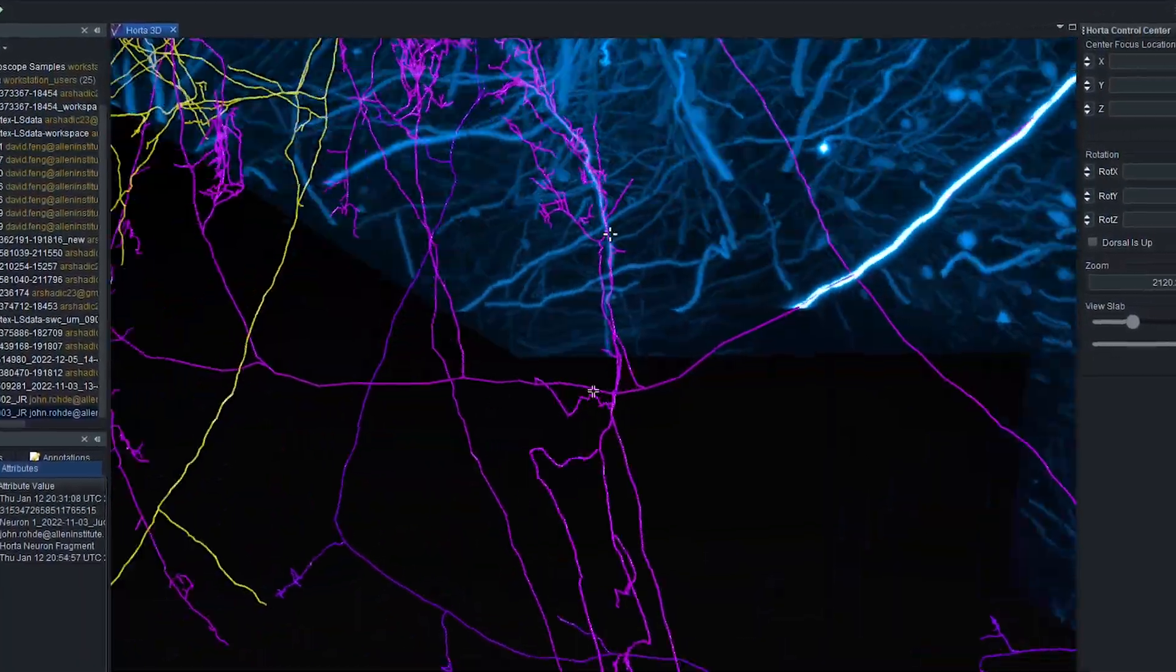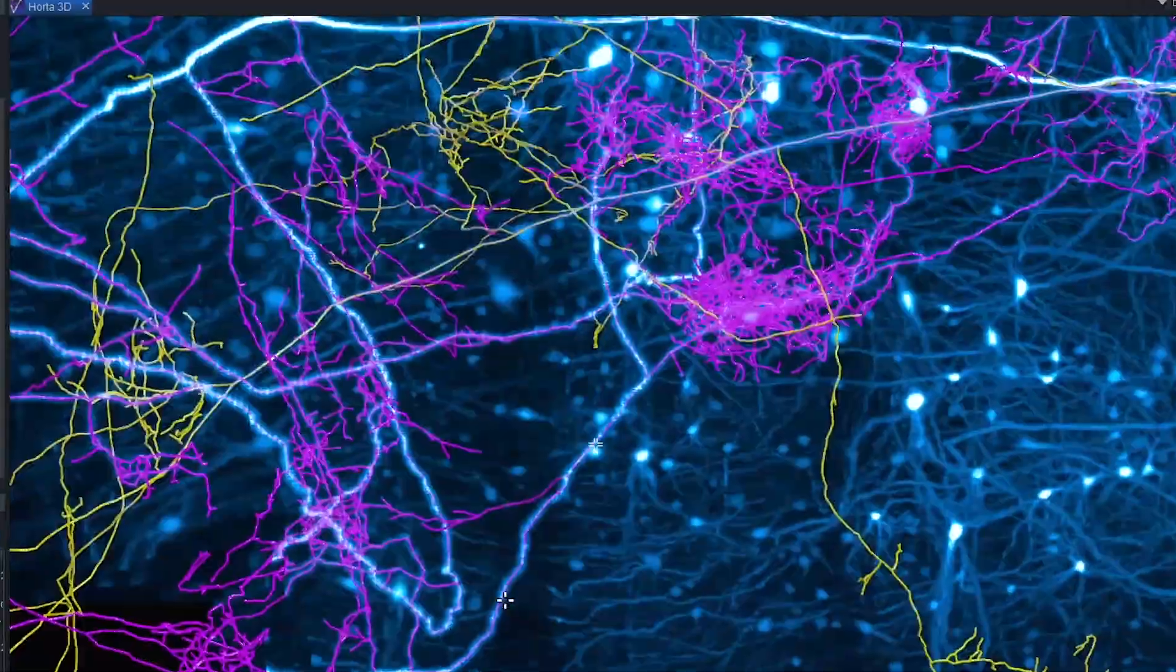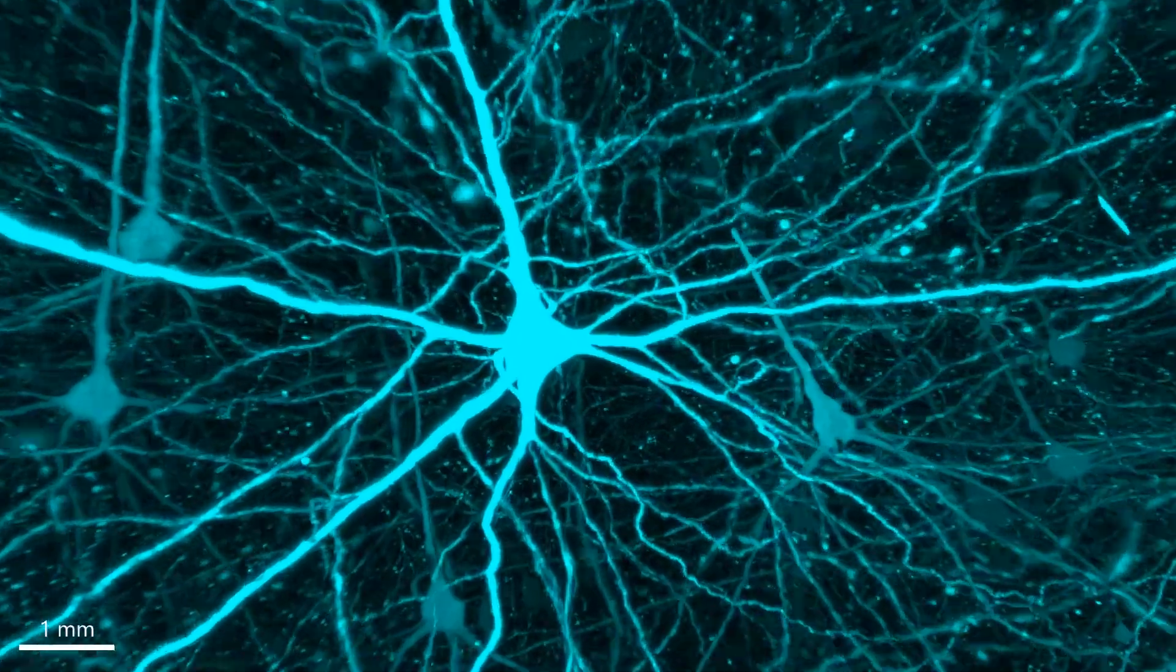We then over the course of several days will build up a large 3D panorama of the fluorescence within that brain which will give us the 3D map of the circuitry of those axons.